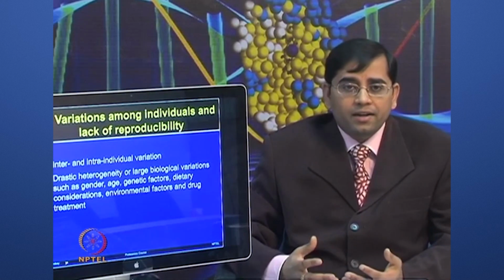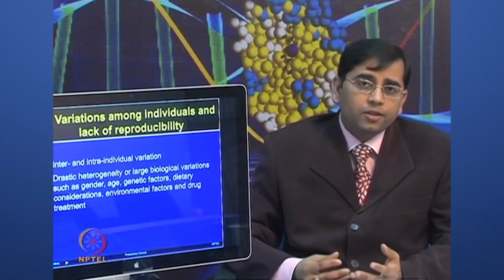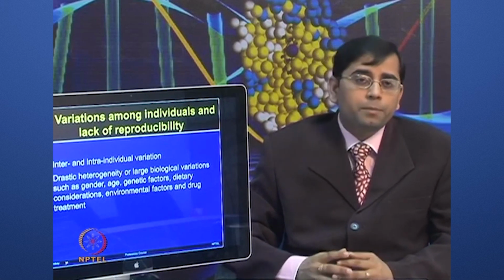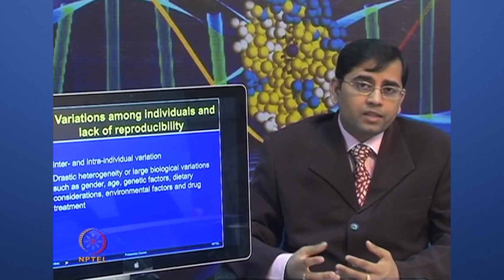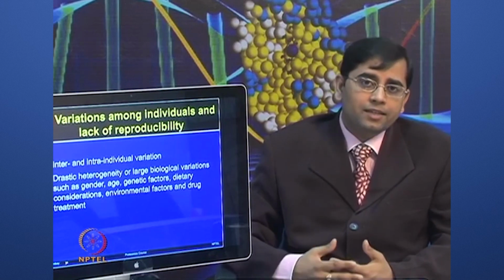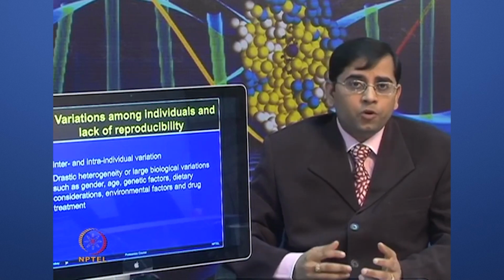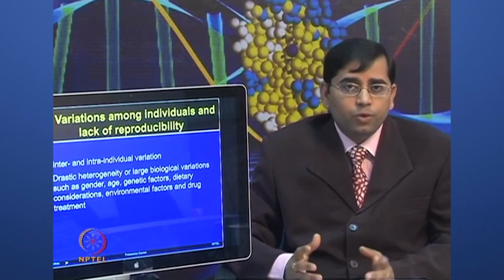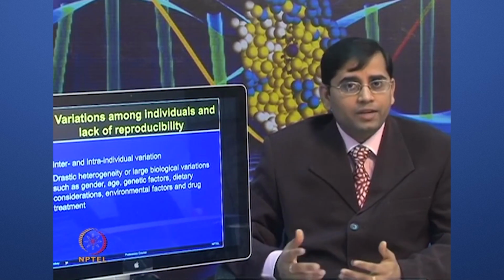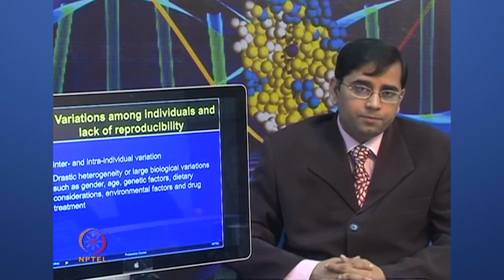So, how to avoid these inter and intra individual variations? If you refer to the previous lecture, when we talked about how to minimize different factors which are going to ensure the success of clinical studies, you will be able to keep an eye on different types of extrinsic and intrinsic influences, which one should try to remove as much as one can during the clinical proteomic analysis.